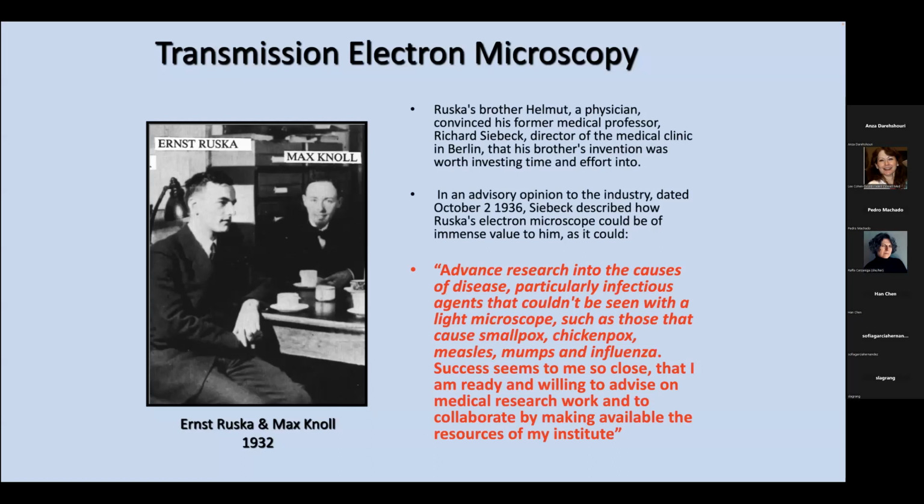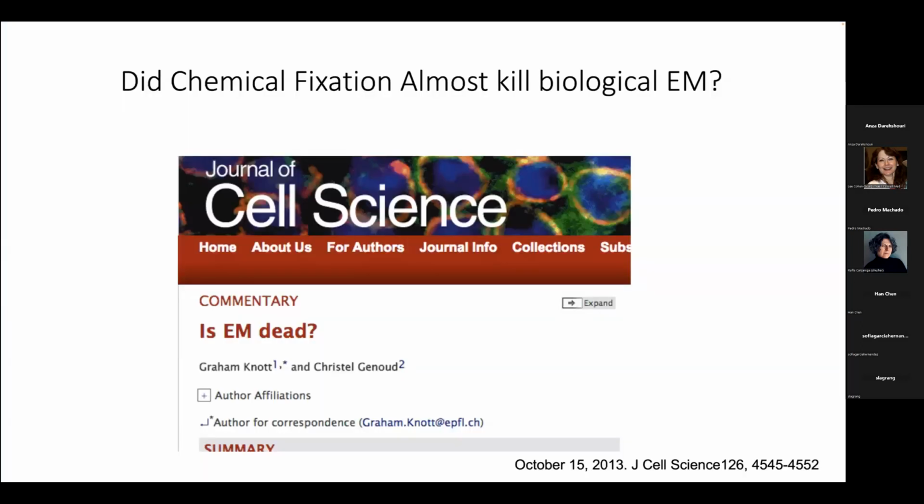From the 30s into the 40s, 50s, 60s, all the way through probably until the 1990s, EM was the go-to technique to study cells. Probably in the 90s is when light microscopy techniques took over. Ultimately, people thought EM as a technique was finished and had no place in cell biology except maybe for a pretty picture.